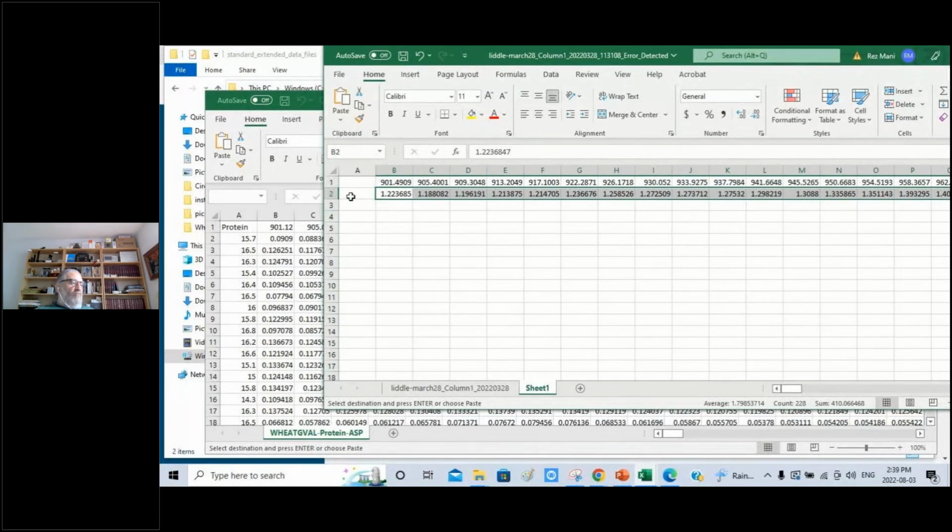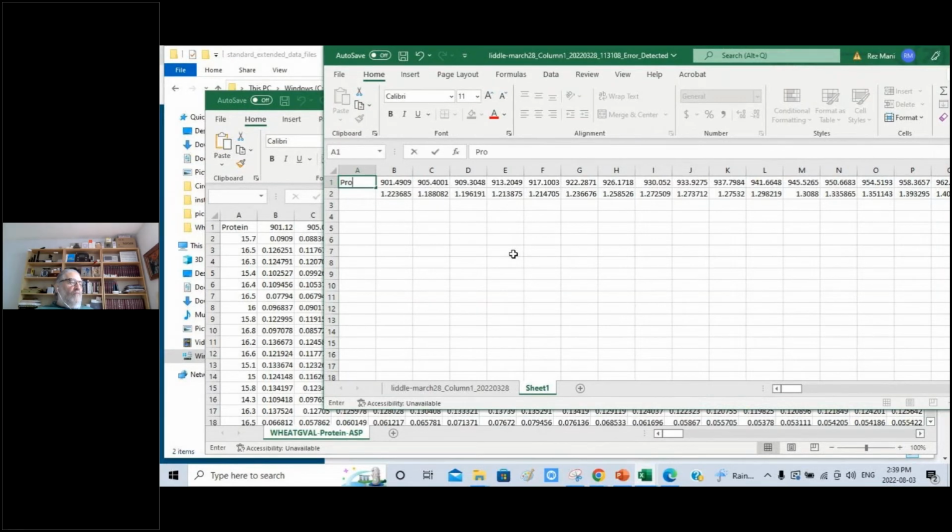And the first column, you reserve it for the ingredient you want to measure. Is it moisture? Is it protein? If it is protein, you say protein, for example. Here, the heading is quite important. So you say what it is that you want to measure, and this is the measurement, let's say from HPLC. You don't have to put the percent, but just the number. Okay, so this way you have to build the calibration file and the validation file.